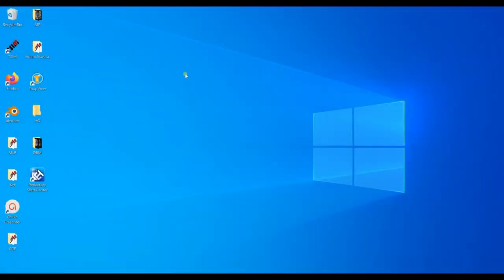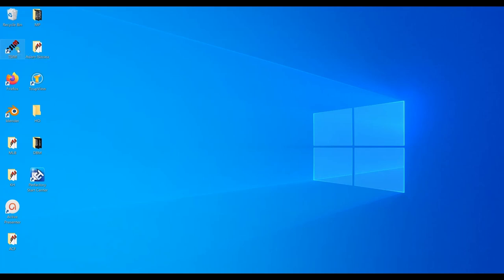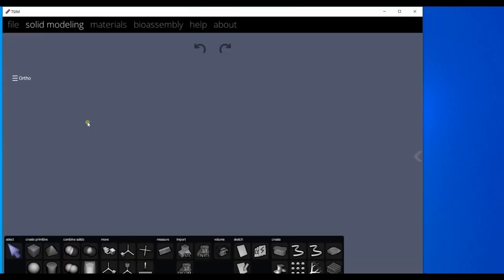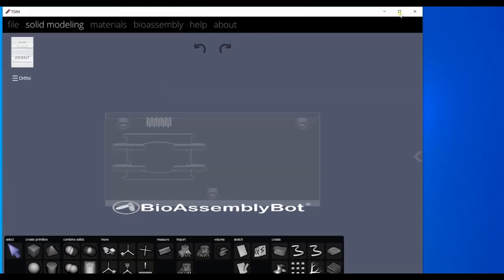We can use the TSIM software to design 3D models, design new material printing parameters, and send print jobs to bioassembly bot printer. To be able to send print jobs to the printer, the computer running TSIM software must be connected to the bioassembly bot using an ethernet cable. Double click to launch the application. TSIM stands for tissue structure information modeling.